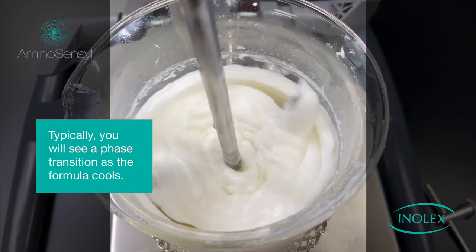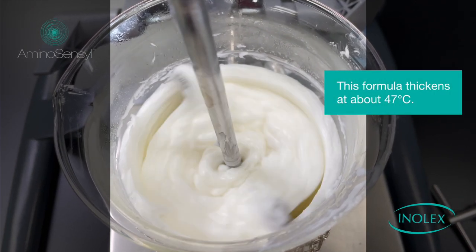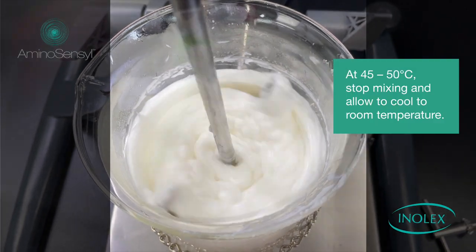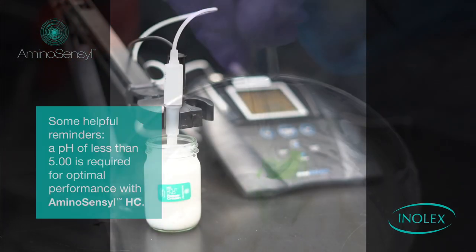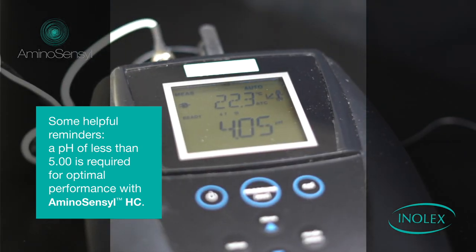Typically you'll see a phase transition as the formula cools. This formula thickens at about 47 degrees Celsius — this is the lamellar gel network forming in real time. At 45 to 50 degrees Celsius, you can stop mixing and allow it to cool to room temperature.